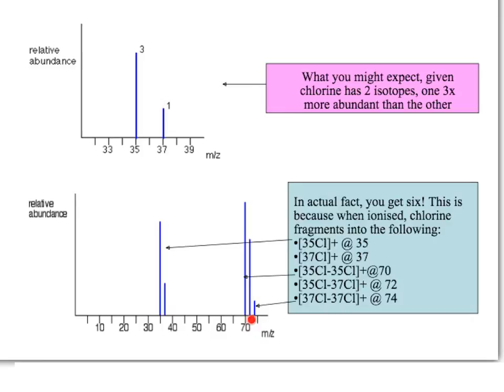So these are due to the fact that chlorine exists as a diatomic molecule. It exists as Cl joined to Cl. So the peaks down here are when these have split up into atoms, or ions even. The peaks here are when it hasn't split up. And the reason we have 3 peaks is because we have different versions of chlorine. So for example, the lighter peak, the one at 70, both the chlorines are going to be chlorine 35s.